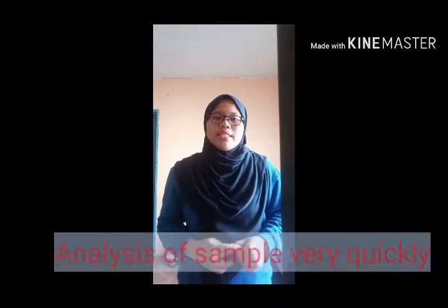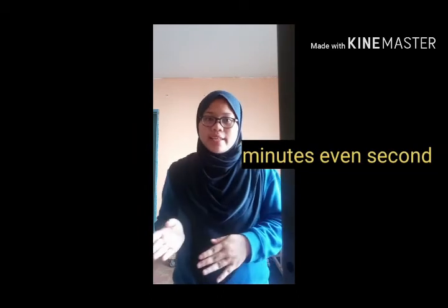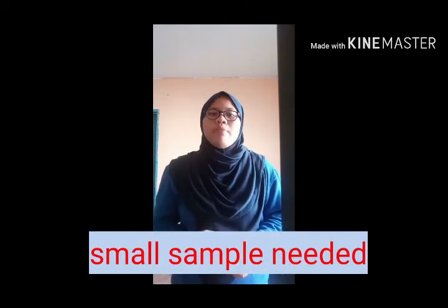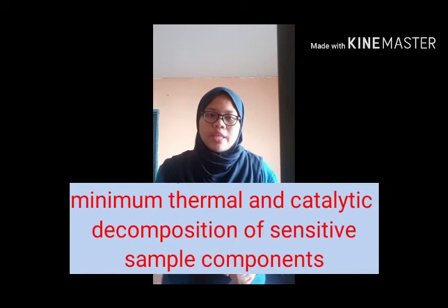Next is analysis of samples very quickly, in minutes, even seconds. Next is small sample needed, microliter to microgram. Last but not least is minimum thermal and catalytic decomposition of sensitive sample components.